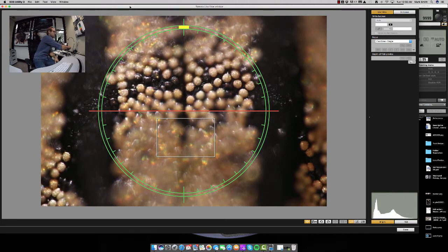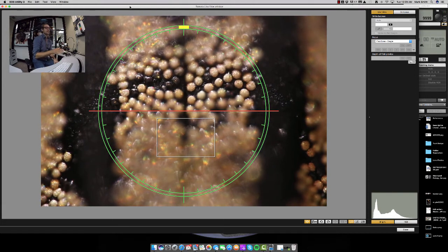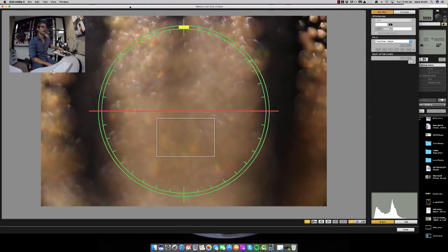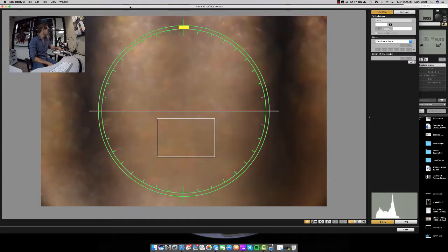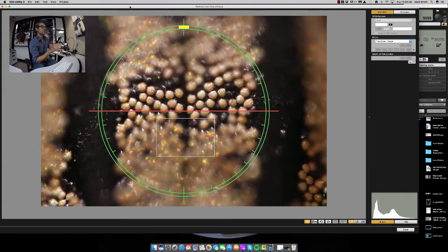I'm just going to enter 150. I'm going to make sure that my shot is nice and centered, just like we had it with the 10x. It does look like the focal plane connects on the left side and the right side of the image in about the same place, so it looks like we're pretty lined up. Now we're going to stack from the back of this sample, so we're going to move the sample forward until everything is out of focus. I don't want to see anything in focus — not even a tiny sliver — just to be safe. That way we don't have to go through and capture a whole new set of images just because I didn't move back far enough. That's the start position, and now we're going to slide the sample back through and capture the end position.